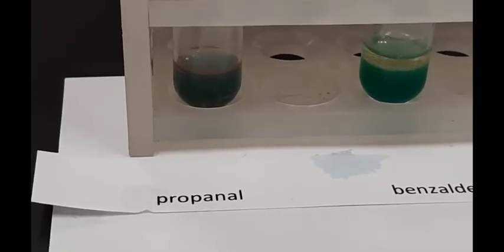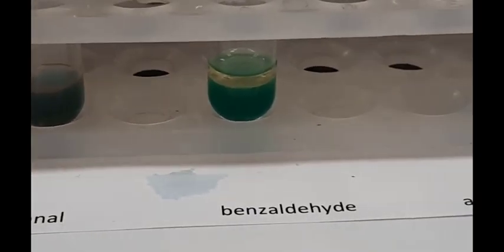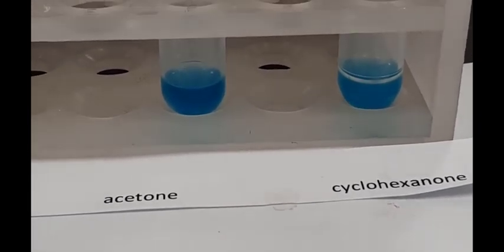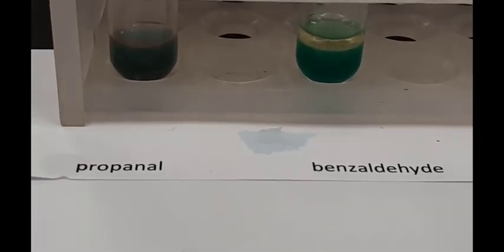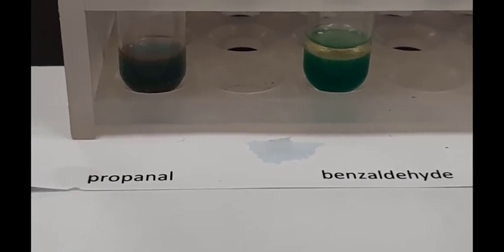And here we have the conclusion of the test with Benedict's solution. So we can clearly see that the cyclohexanone and the acetone still have the same blue color as Benedict's. However, propanal and benzaldehyde have gone to a greenish color, indicating some oxidation has occurred.